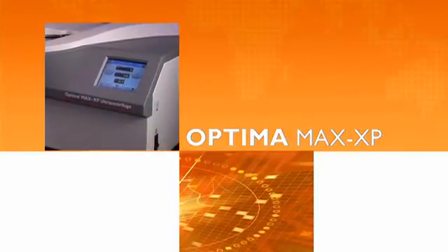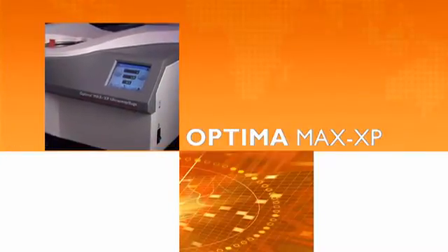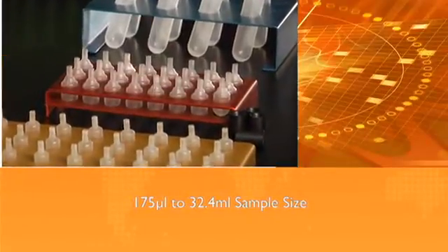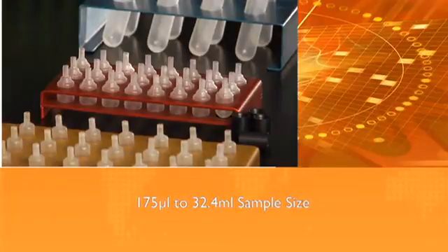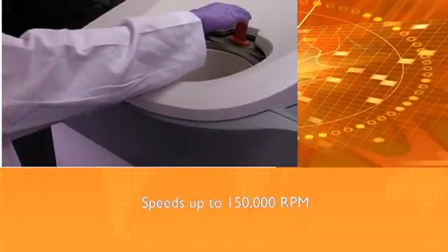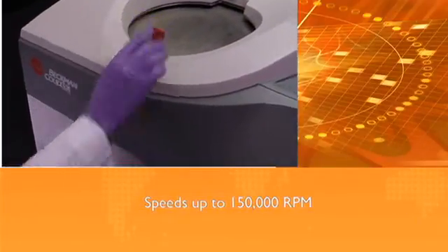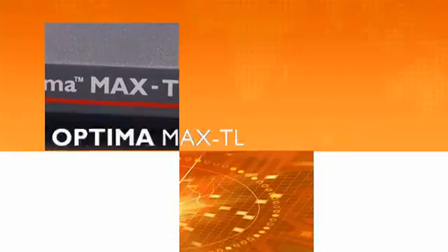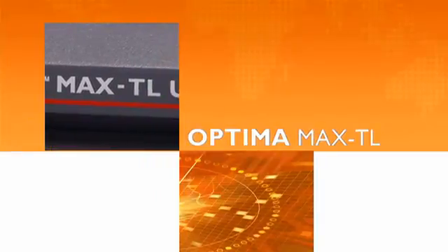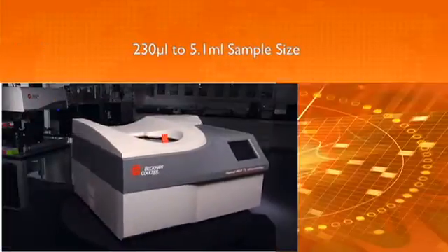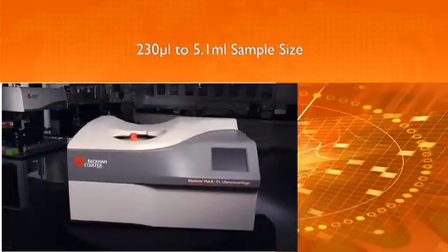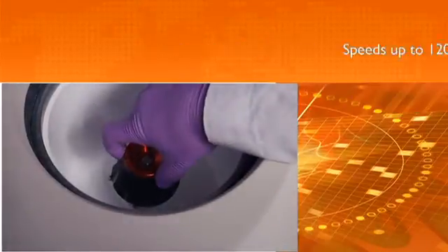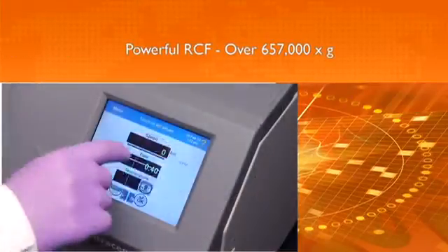The Optima MaxxP delivers fast, efficient separations of samples as small as 175 microliters up to 32.4 milliliters, and at speeds up to 150,000 rpm, and forces of over 1 million times g. And the Optima MaxxTL delivers separations of samples from 230 microliters up to 5.1 milliliters at speeds up to 120,000 rpm and forces up to 657,000 times g.